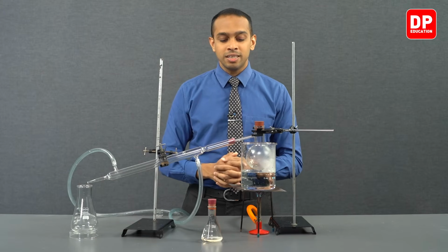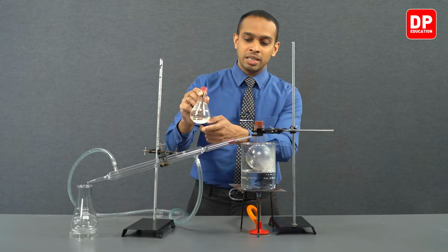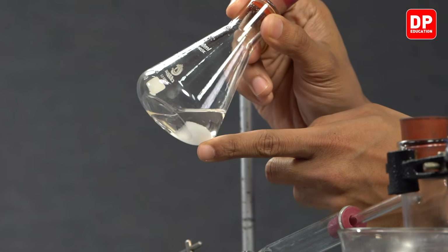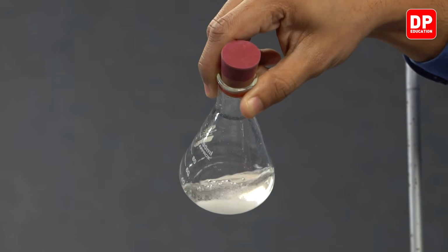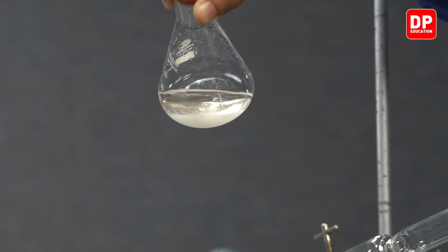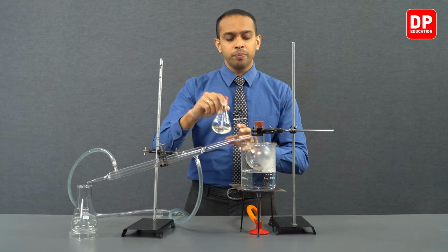So let's add our essential oil and diethyl ether mixture that we have over here. You can see the sodium sulfate that we added earlier. It is not clumping together. When we mix it, we can see it is not clumping together still. It has been quite some time now. It is not clumping together. This is indicative of the fact that all of the water in the mixture is now removed.